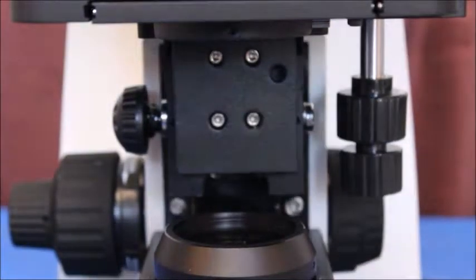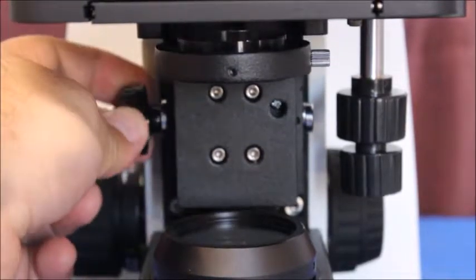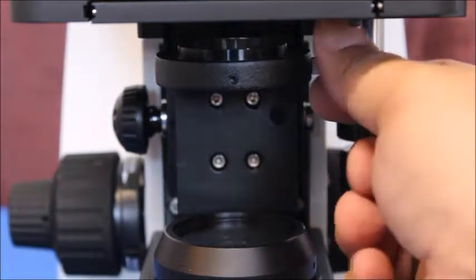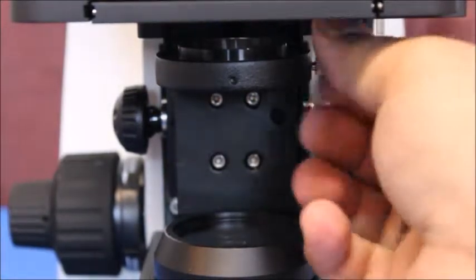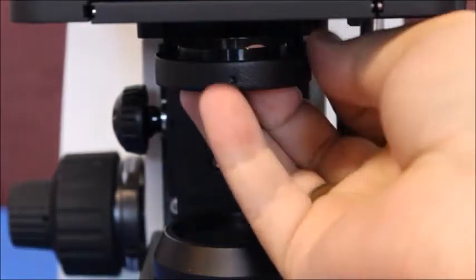Now we're going to come around to this side and lower this condenser carrier and you'll notice there's a knob right here. It's pushed all the way in for shipping so we want to unscrew it a good bit and you can feel on the inside where it pushes.